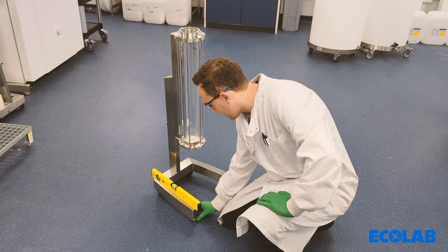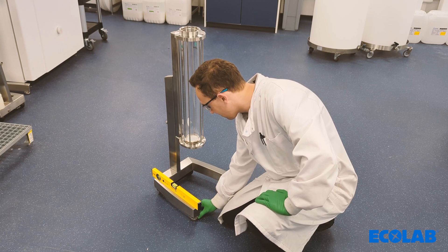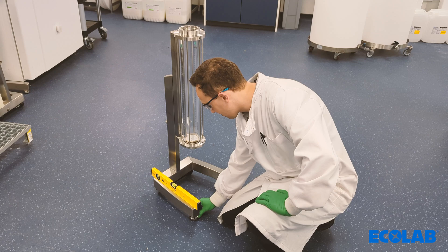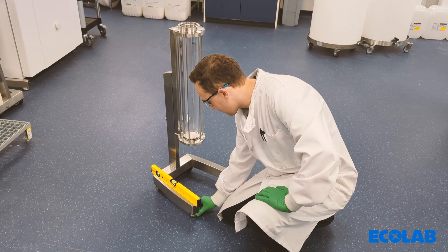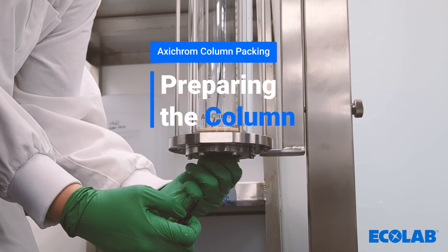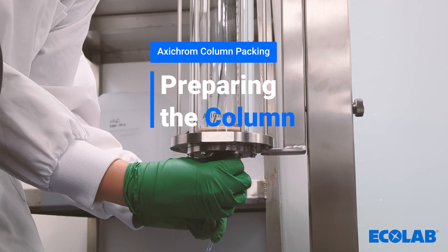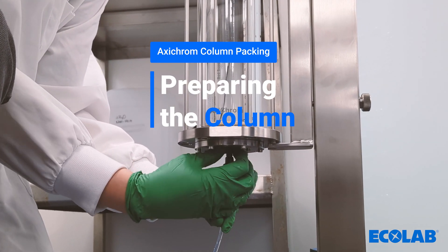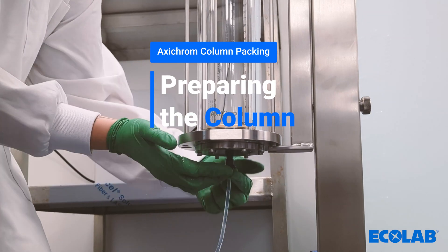The first step in preparing the column is to level the column. Prior to priming the column, ensure that the system is primed and no air is present in the lines. The bottom of the column can now be attached to the system and a low flow applied to add 1-2 centimeters of water to displace any air from the bottom frit.